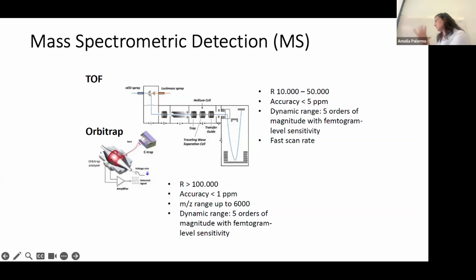But you can also set it to a specific range or a specific molecule, also called a precursor, in order to isolate that precursor and then send it later on to the time of flight detector, right? The time of flight detector is here. In the lab, you can see it's a long tube where your molecule enters, and based on the difference of potential, follows this trajectory as an arc. Depending on the mass, these molecules will separate in the run and hit the final detector at different times, right? So that's the whole principle of separation.